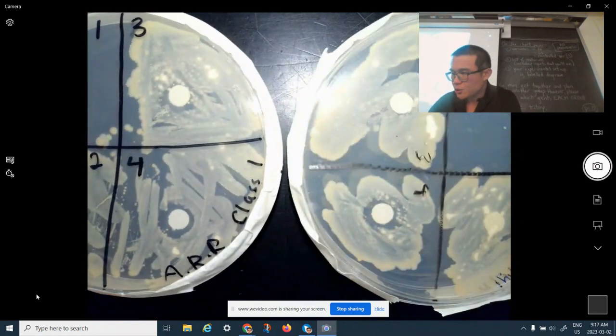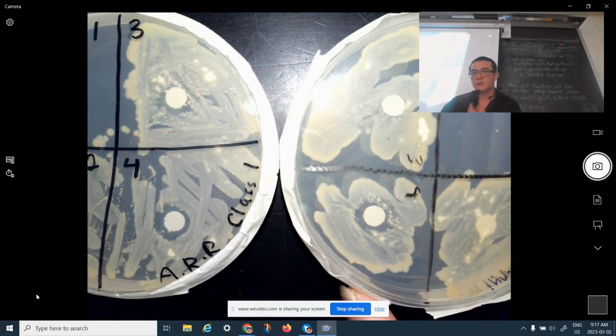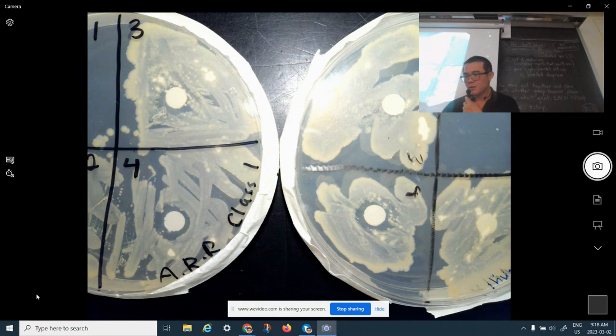Now, if you look here, I'm just using two groups' plates. You will notice that the zones of inhibition are almost never perfectly circular. Theoretically it should be. In reality, they almost never will be. Okay, that's just how science is. Theoretical, versus realistically, what happens?